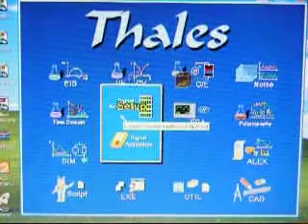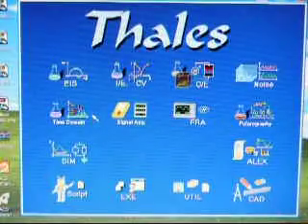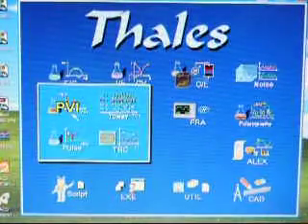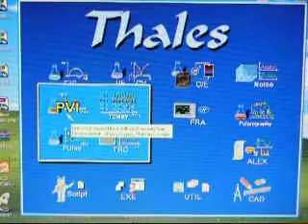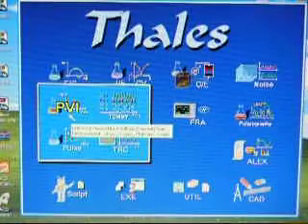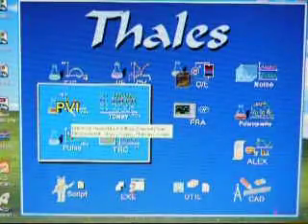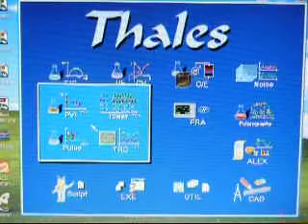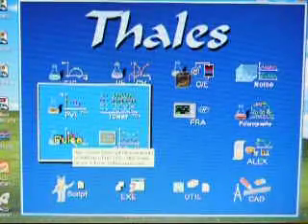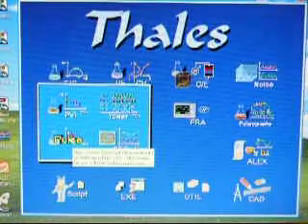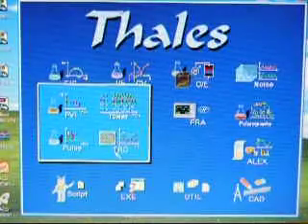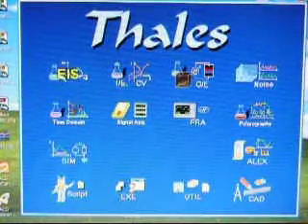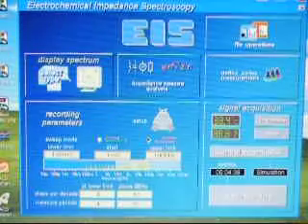Signal acquisition is set up and displayed for time-domain data input channels, and this allows us to define experiments such as programmable voltage and current for arbitrary waveform generation. Pulse is just what you would expect. We can set up high current pulses for fuel cell testing, and then we have transient recorders that will capture the high frequency transients. Here we'll start the EIS screen.